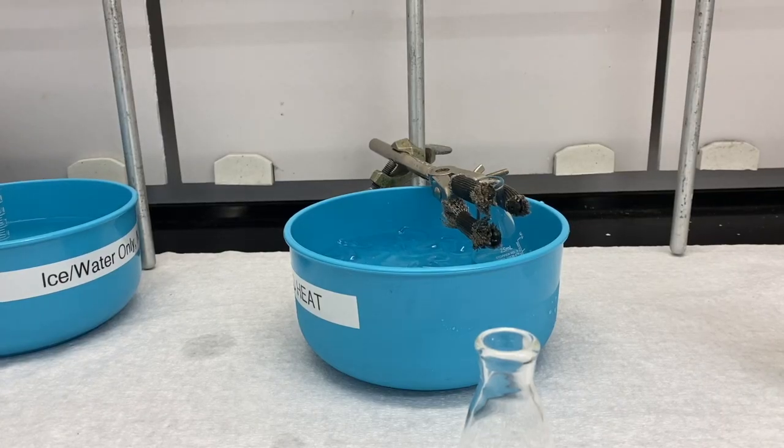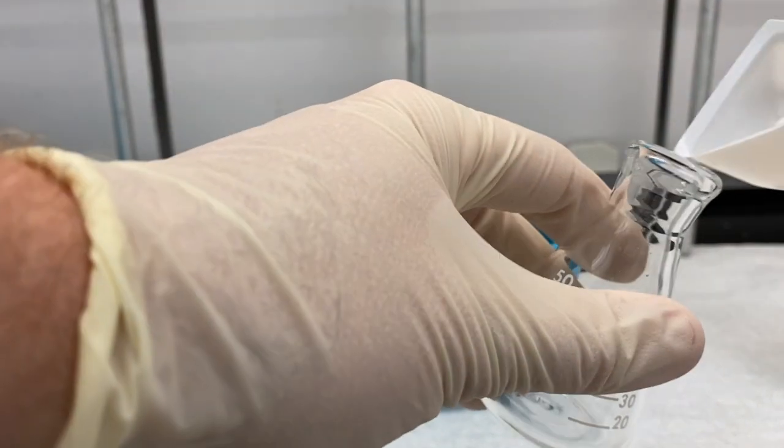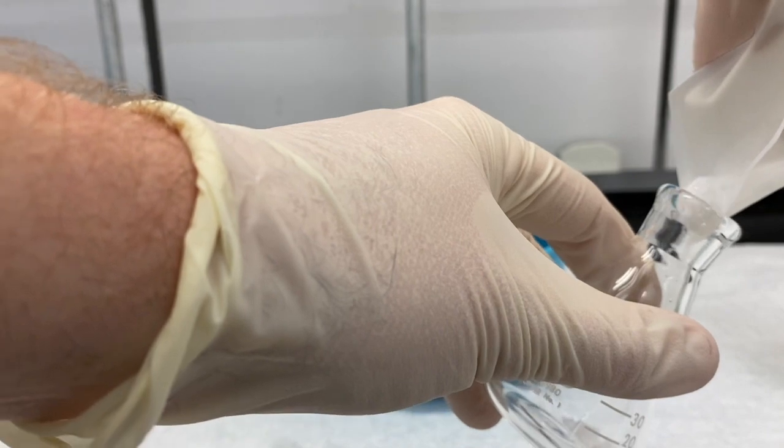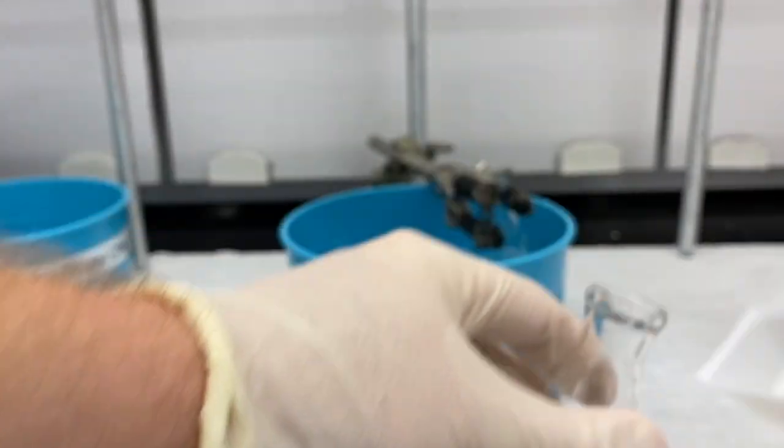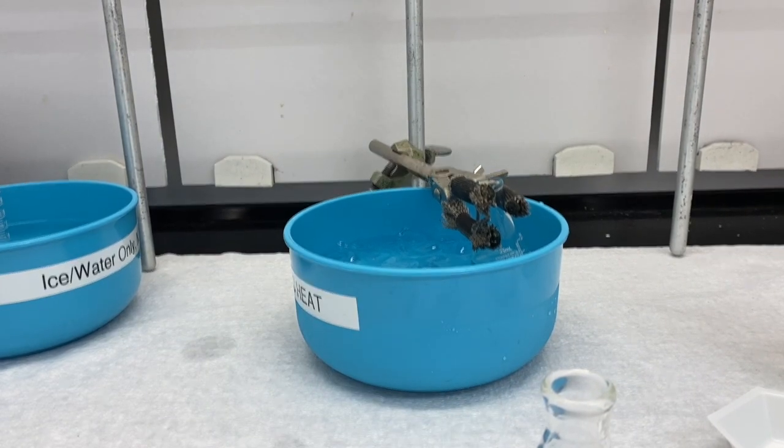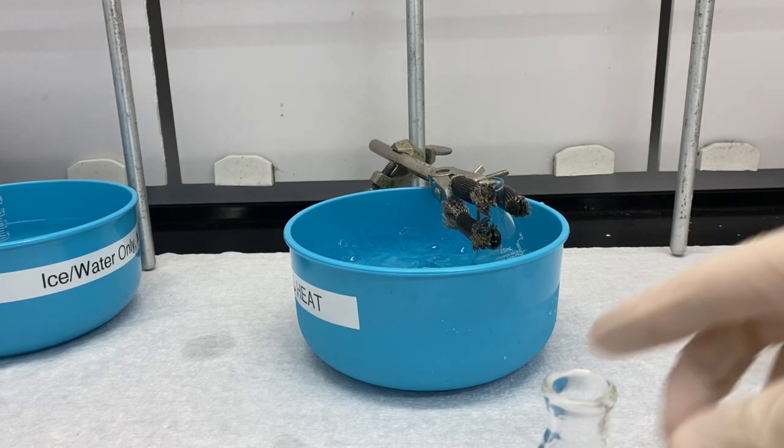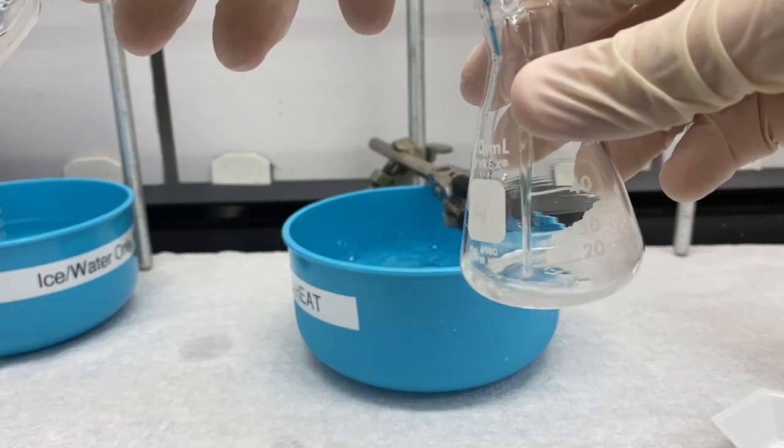All right, so we're going to place our dimethoxybenzene in our 50 ml Erlenmeyer flask. You can see in the back I've got the sulfuric acid chilling. I'm going to add my glacial acetic acid, 10 ml.